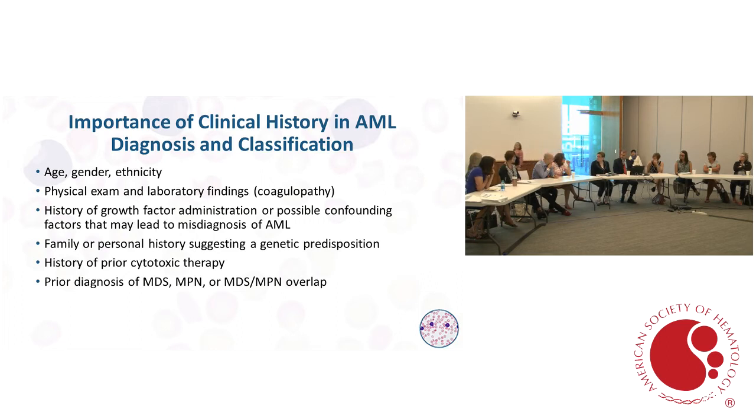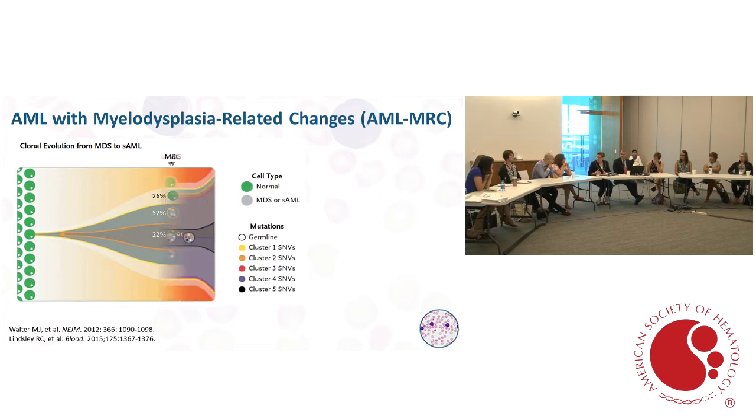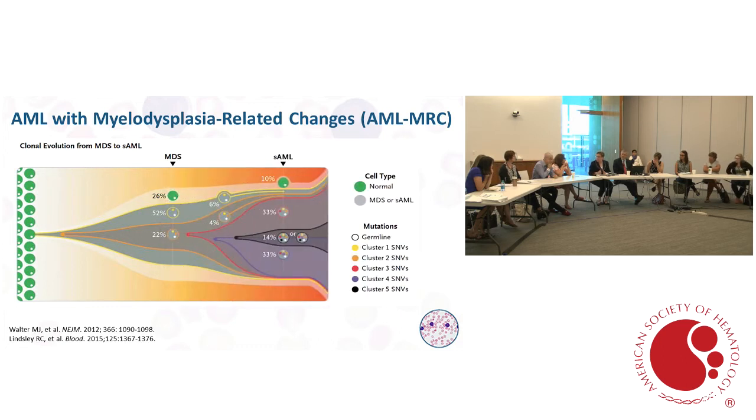Yeah, could we repeat the last part about the gain or loss of a chromosome? Let's say the loss of a chromosome 7. If we only see it in 2 cells, by definition, it's not a clone. You would have to see it in 3 by convention. But that can be modified a bit if you don't have a good dividing cell population. You can use FISH to see if that really is clonal or not.